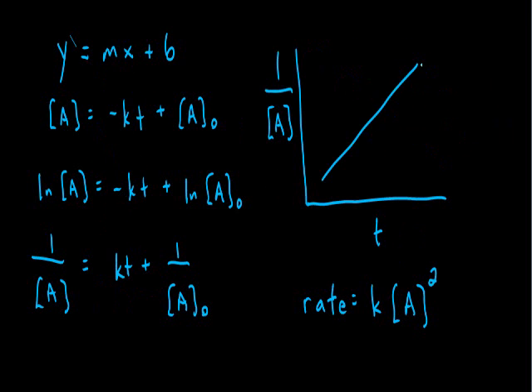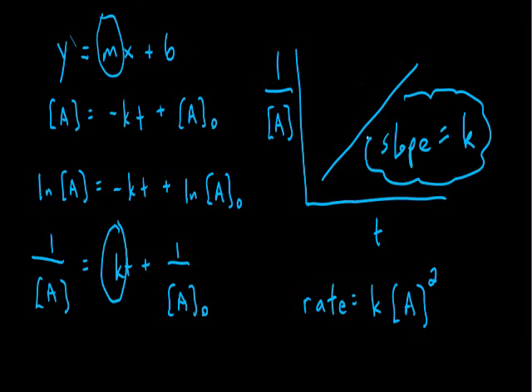For the 2nd order rate law expression, because this plot gives us a slope that has a positive value, the slope of the line gives us our k value for our rate law expression, if the graphical analysis indicates that we have a 2nd order reaction with respect to chemical A.